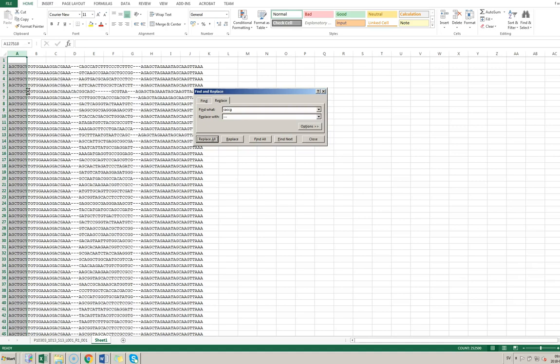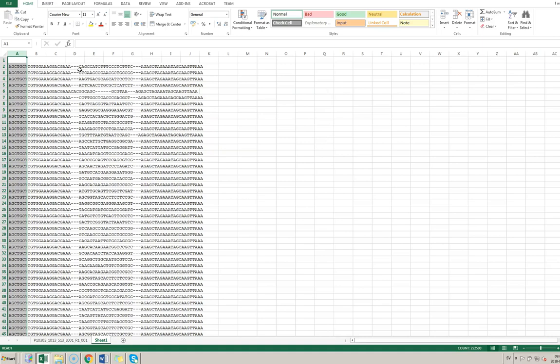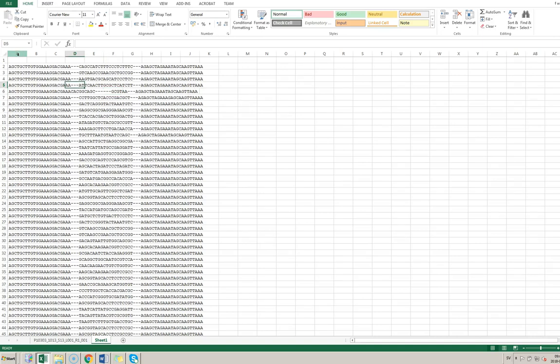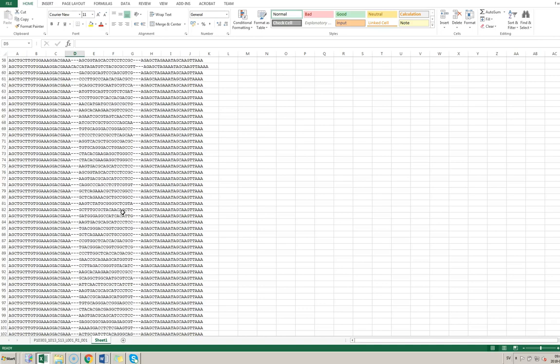As this replacement goes through, you'll start to see that some reads are not behaving as expected. Most of them show the 5' adapter, then the replaced sequence, then the guide RNA portion — but some behave differently. This is an error that this approach introduces, because you may find sequences within the guide RNA itself that contain 'CACCG' or 'GTTT', and those will be incorrectly modified. This is once again not optimal for this analysis.